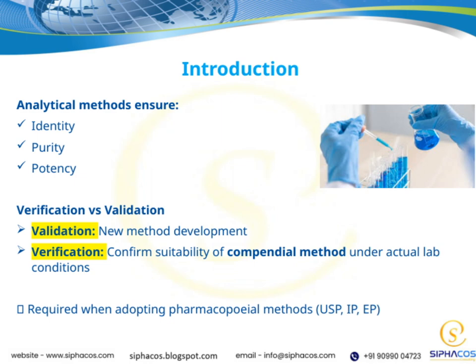This step becomes especially important when we adopt pharmacopoeial methods. We need to verify that these methods perform as expected here, so the results we get are trustworthy. Overall, both verification and validation are key to maintaining high quality standards and ensuring compliance with regulatory expectations.